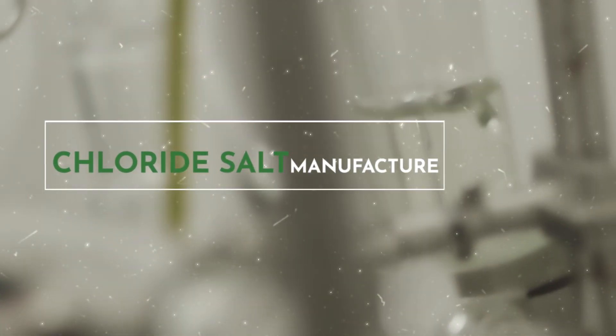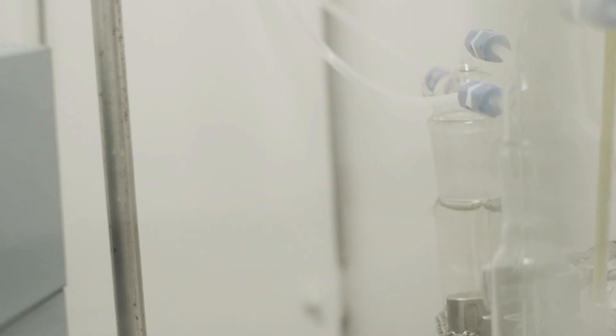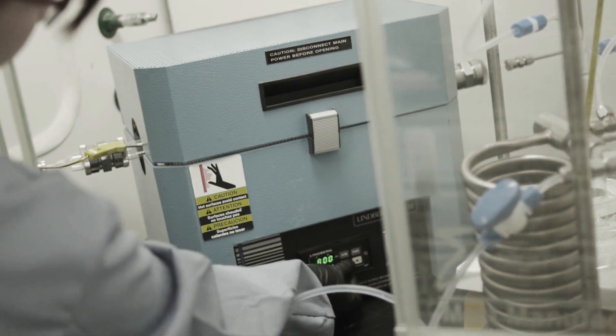Chromium chloride is actually one of the products of corrosion in chloride salts, so being able to look into the properties of that is very important for any of the corrosion studies. This setup is for the production of chromium chloride salt.